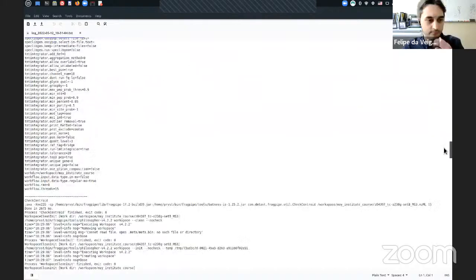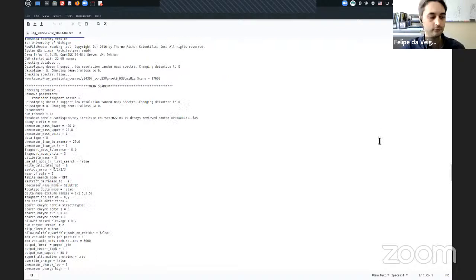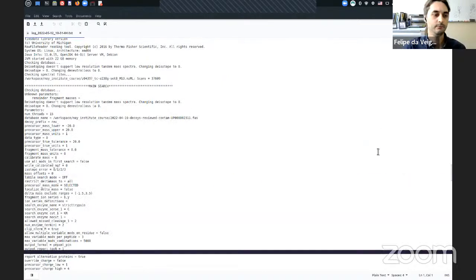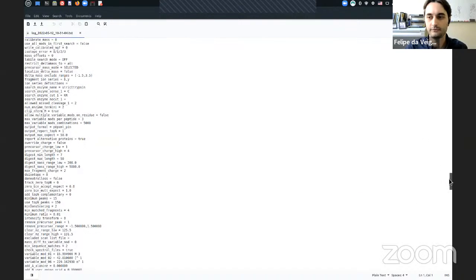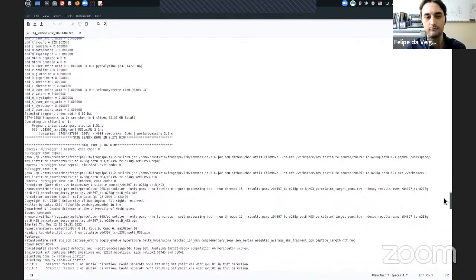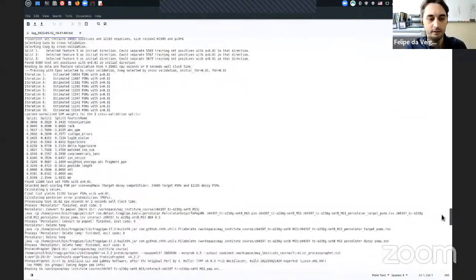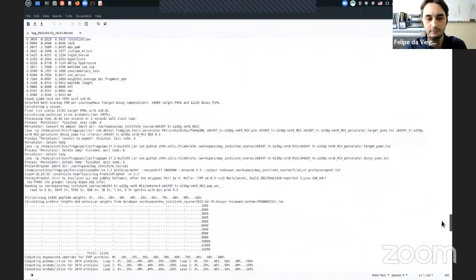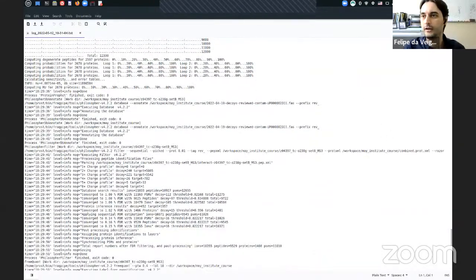This is especially important when you are submitting issues to us via GitHub, because that's pretty much the only way we can know what kind of analysis you did, which steps you ran or what workflow you executed, and we can debug in a better way to try to find the problems you're having.